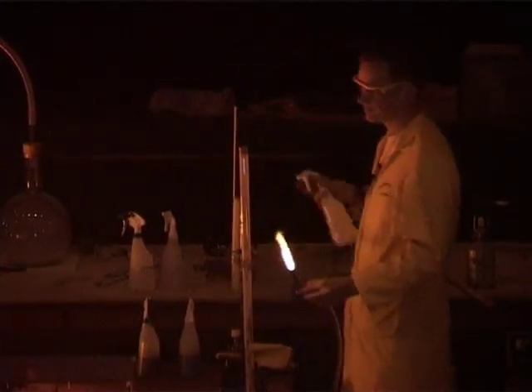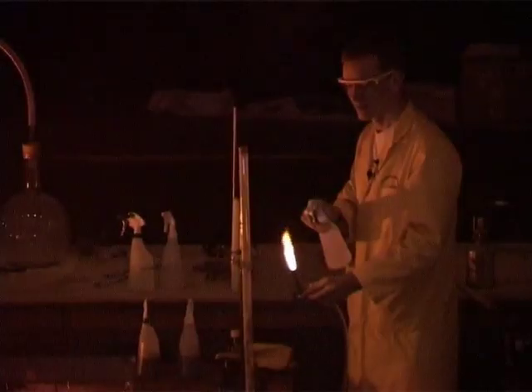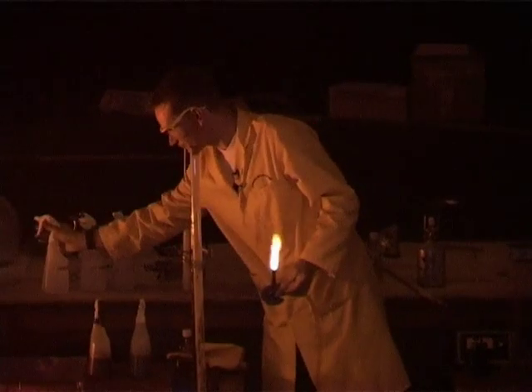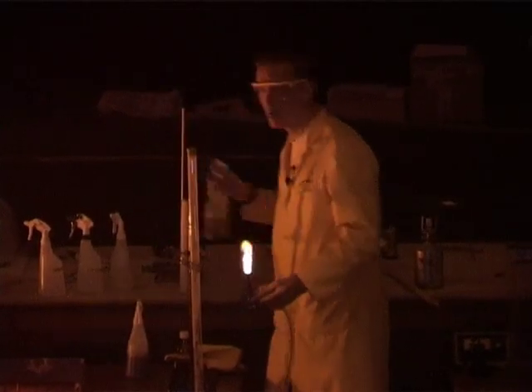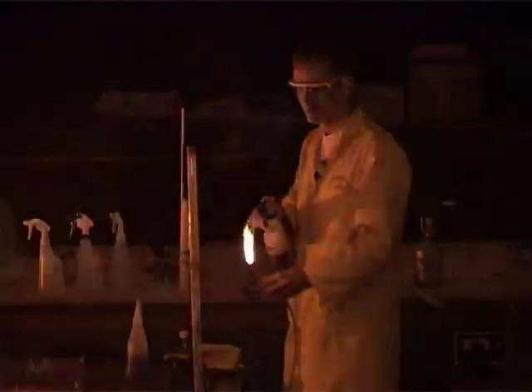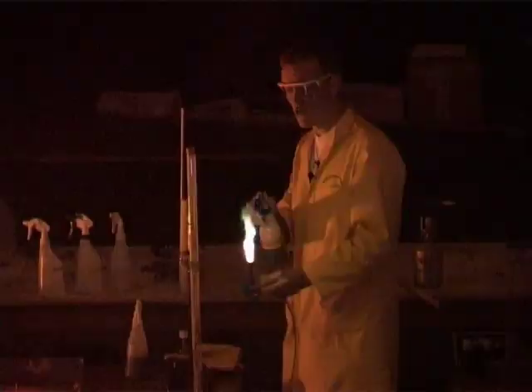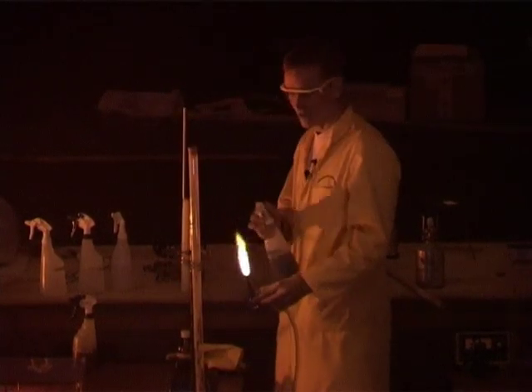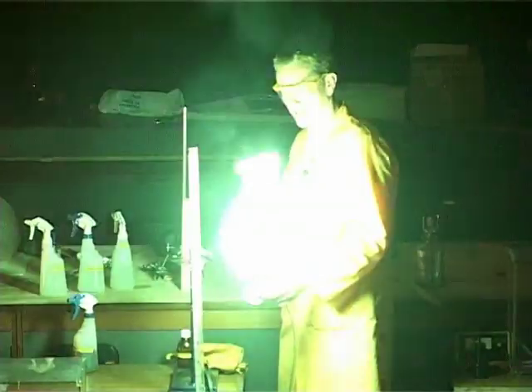Lithium gives a nice red. And copper, well, this one's just given a sort of greeny blue. And this one gives even more intense green. This is also copper.